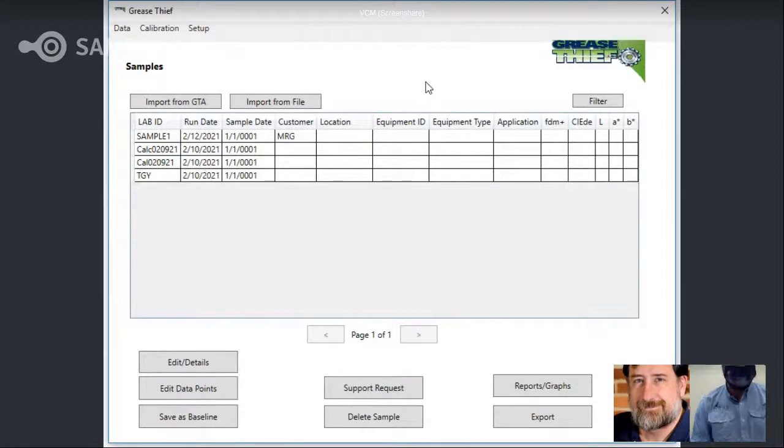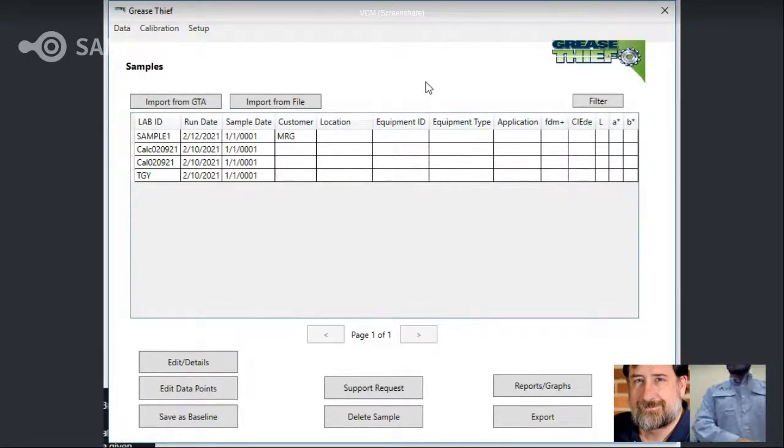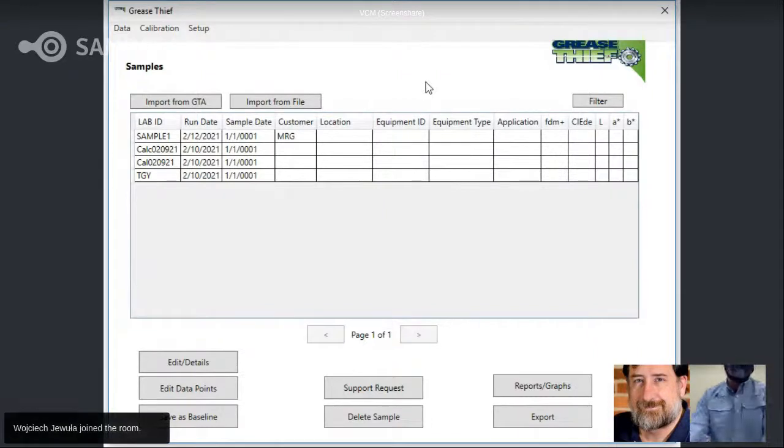And then there's a follow-up question to that, and the answer was the advantage of running a sample through the flow channel is that variations in consistency that might be there due to hard sections of grease or softer sections of grease can be seen in variation along the extrusion profile. So we have seen that sometimes at the beginning the GTI profile is lower or softer, where there's a different grease. And then as you get to the back and it's two different greases mixed in the grease thief, the consistency value, the GTI profile, will change for that second portion that gets into the extrusion profile.